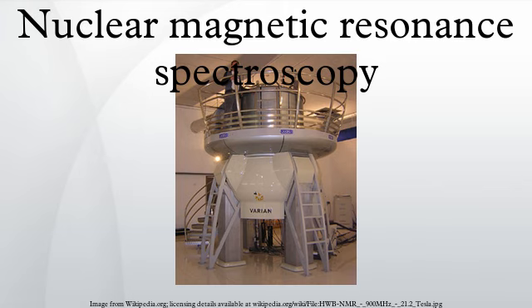Two-dimensional NMR spectra provide more information about a molecule than one-dimensional NMR spectra and are especially useful in determining the structure of a molecule, particularly for molecules that are too complicated to work with using one-dimensional NMR. The first two-dimensional experiment, COSY, was proposed by Jean Jeener, a professor at Université Libre de Bruxelles, in 1971. This experiment was later implemented by Walter Aue, Enrico Bartholdi, and Richard Ernst, who published their work in 1976.